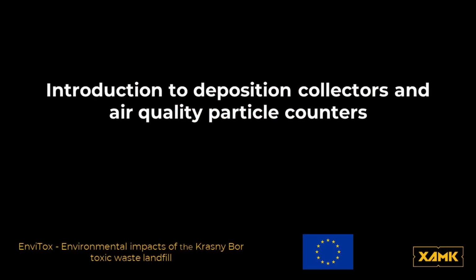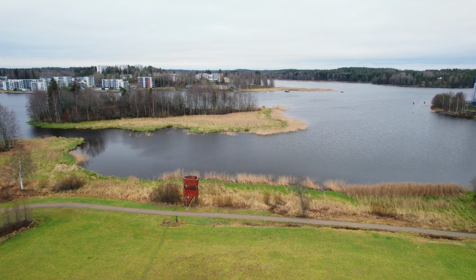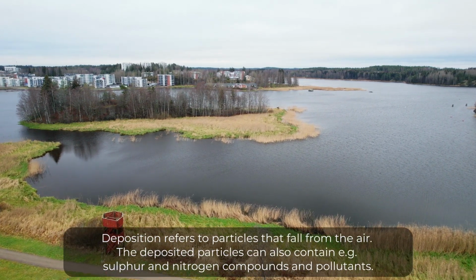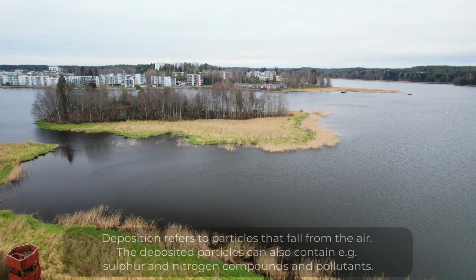This video is about general topics related to deposition sampling and air quality particle measurement. Deposition means the particles falling from the air onto the ground or into water that may contain nutrients or pollutants. Deposition can occur as dry deposition or wet deposition with rain.